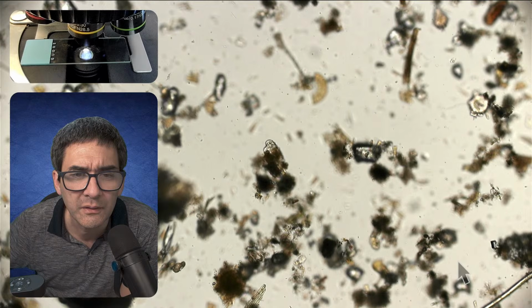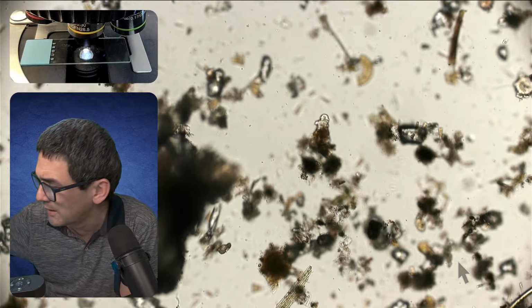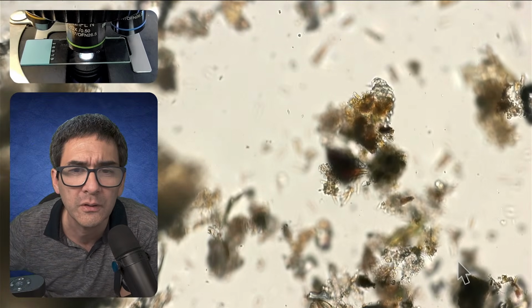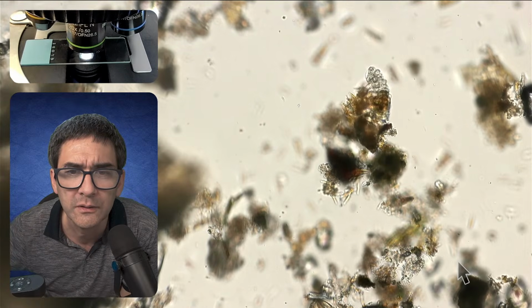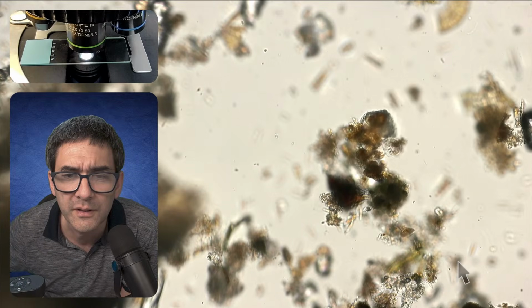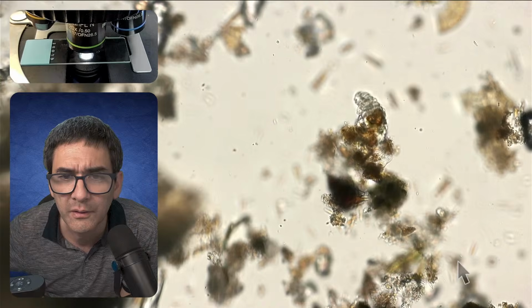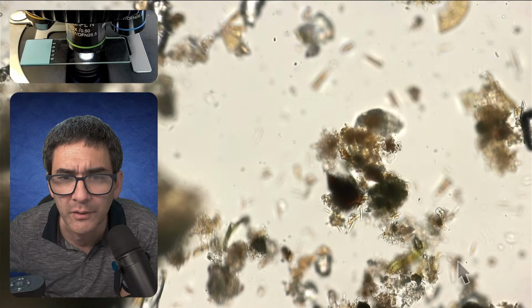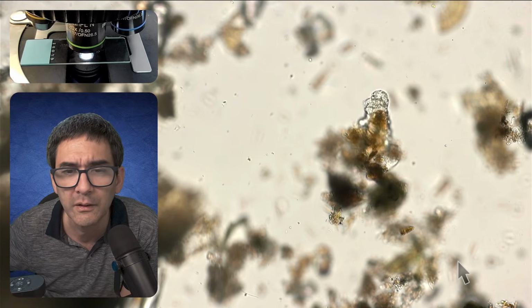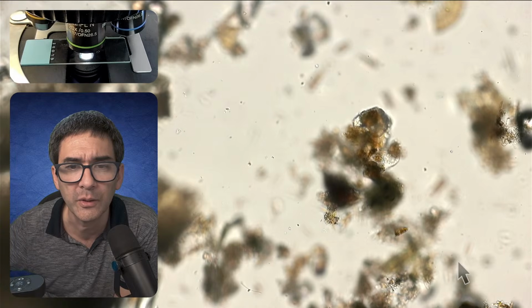What's that? What is this? Let's see. I'm hopeful. I am hopeful. Is it a rotifer or is it a water bear? This looks very much like a water bear. Yup. Could it be? Yes. Tardigrade. Here we go.